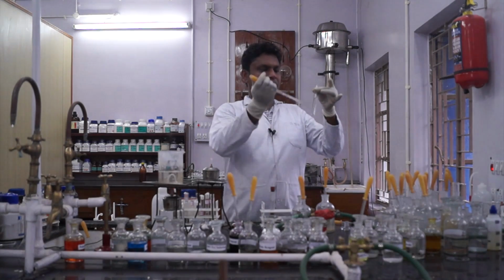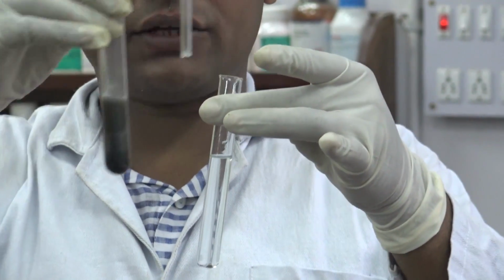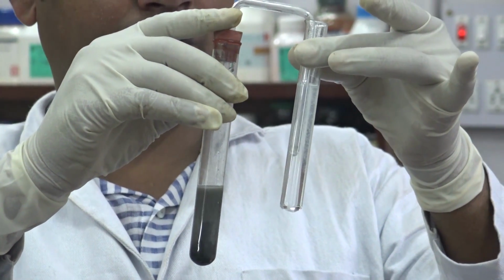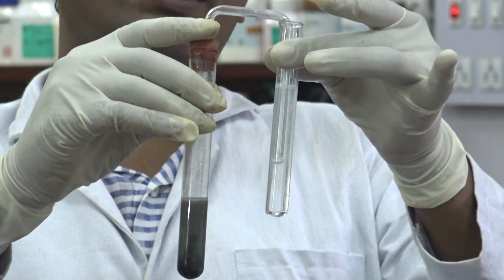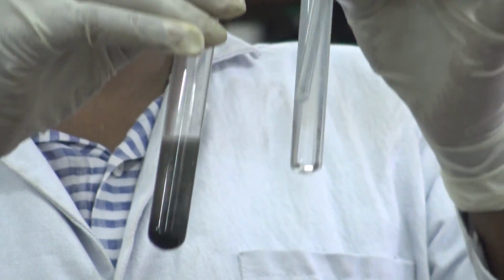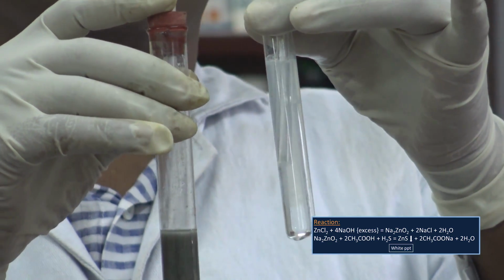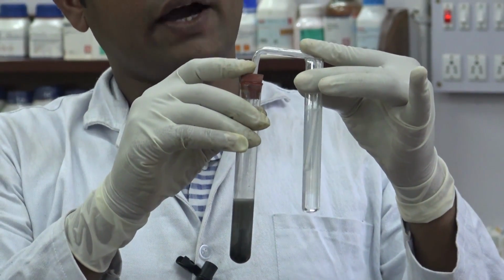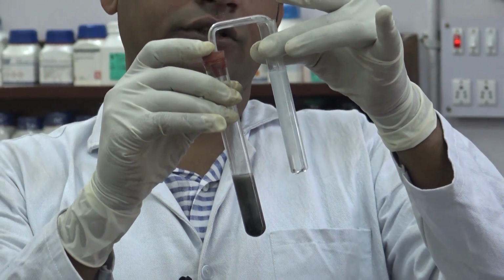After acidifying the solution using acetic acid, pass H2S gas through it. Here we can see that white precipitate occurs. The formation of white precipitate on passing H2S gas in acidic condition confirms the presence of zinc ion in our sample. Here one thing is notable, that only zinc sulfide is white in nature, and this is the confirmatory test for zinc.